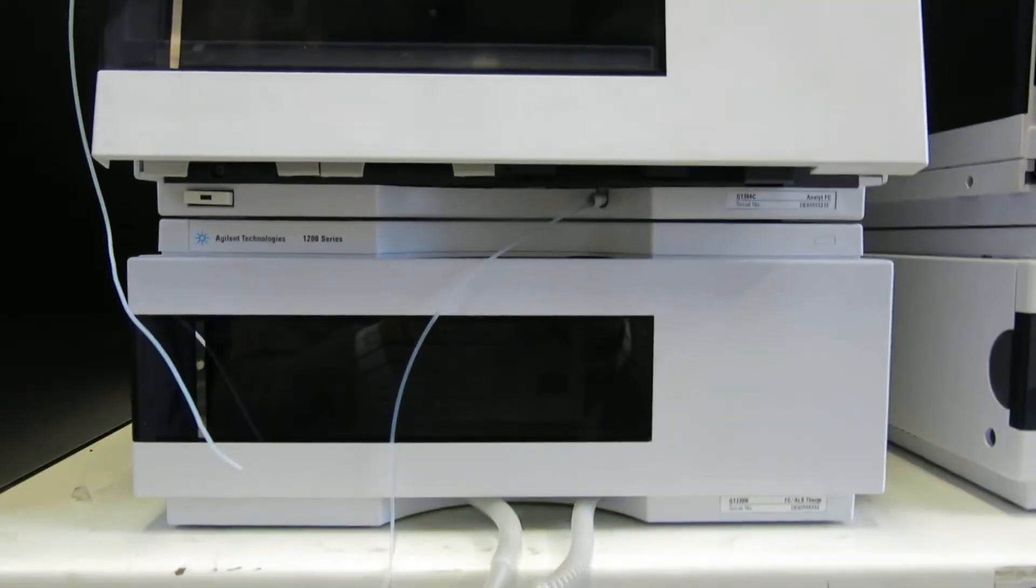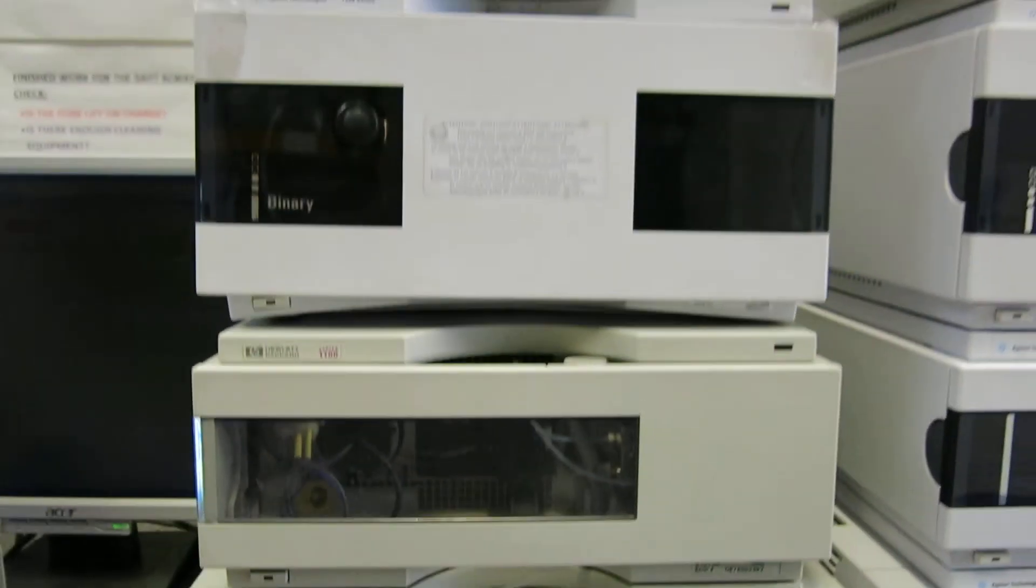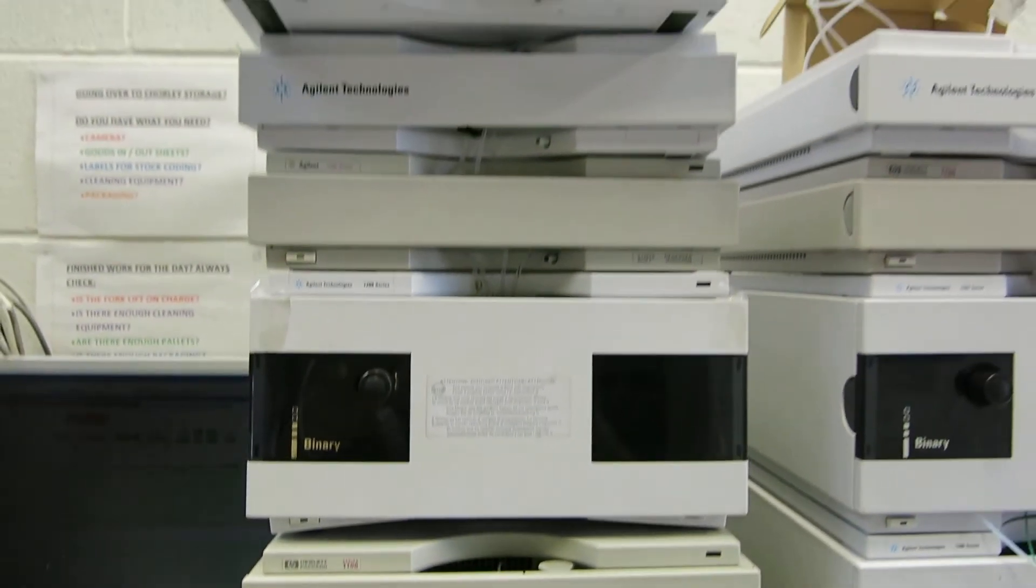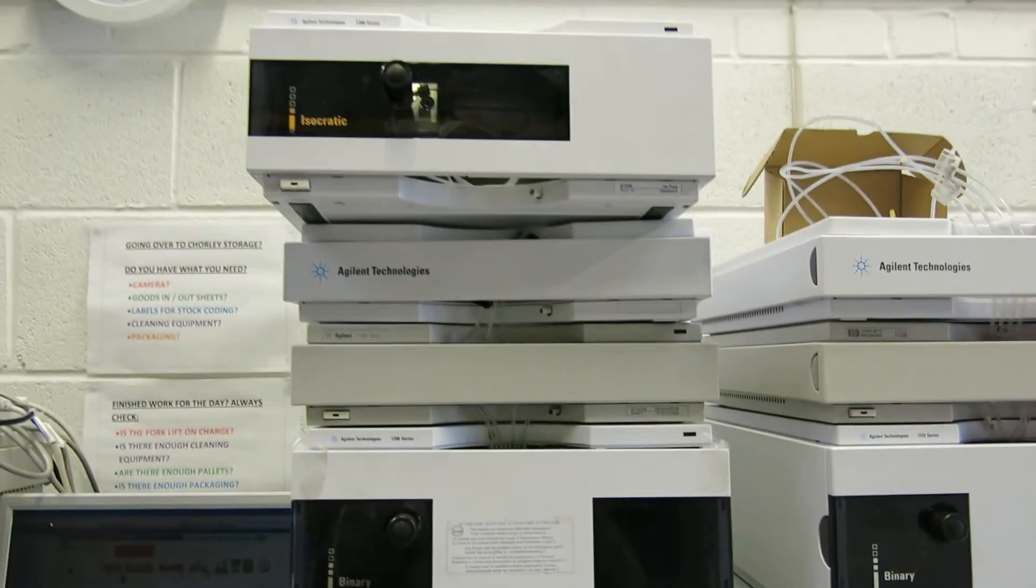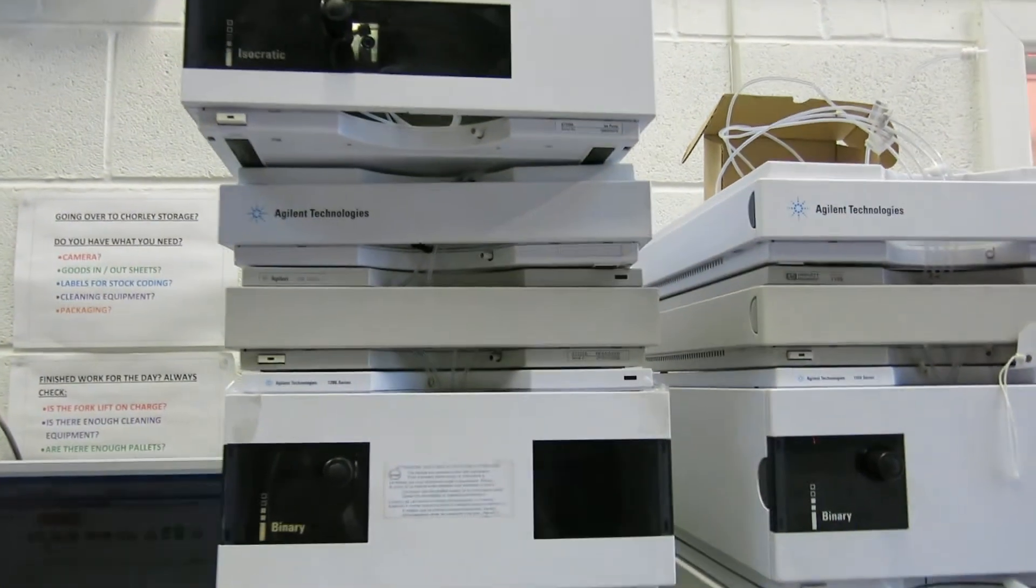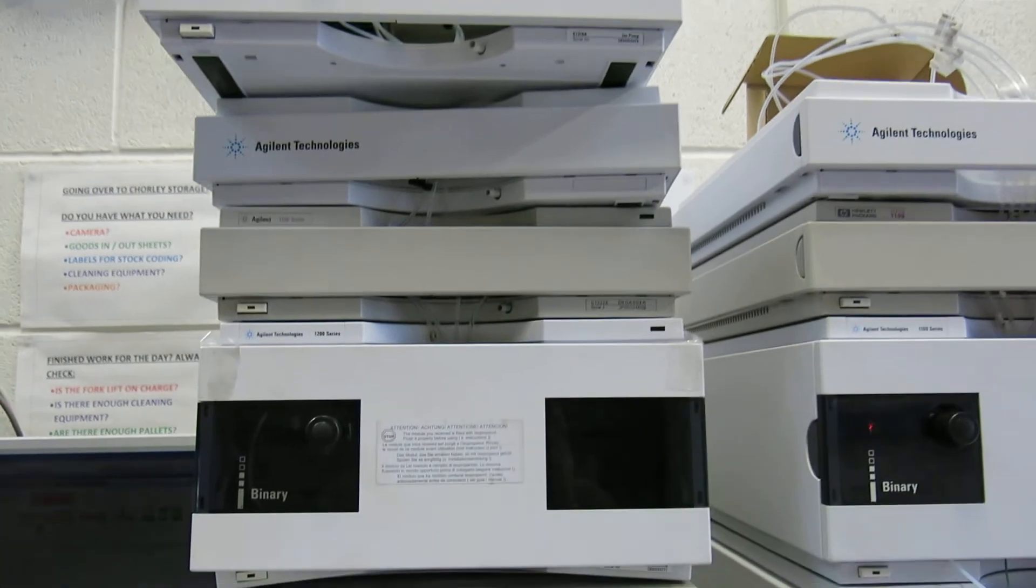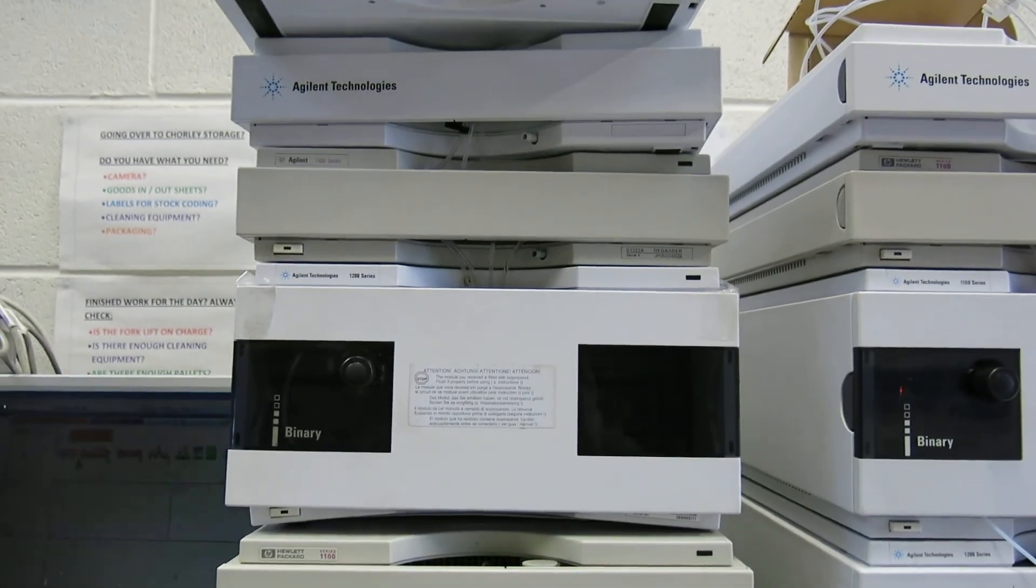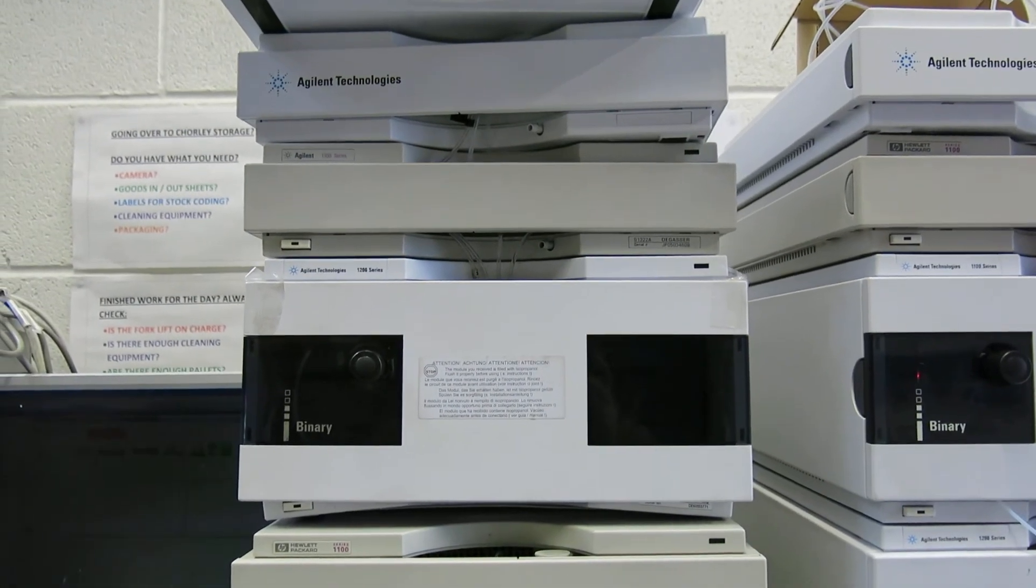So hopefully that gives you an idea as to the configuration on this particular system. As I say there's a choice there between the isocratic and the binary pump.